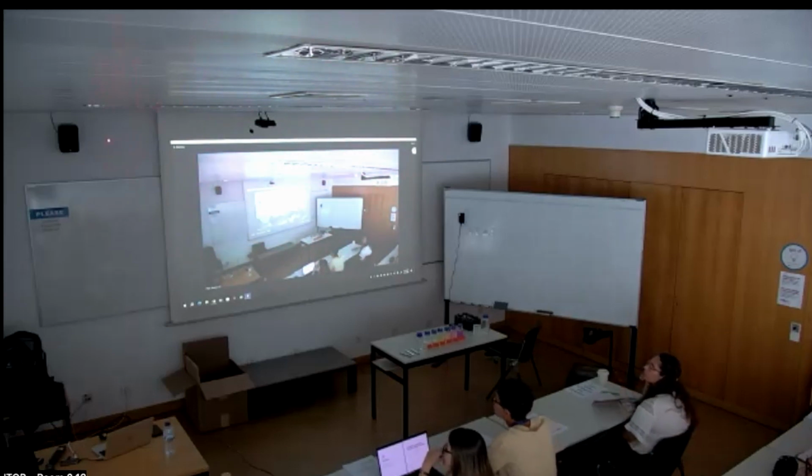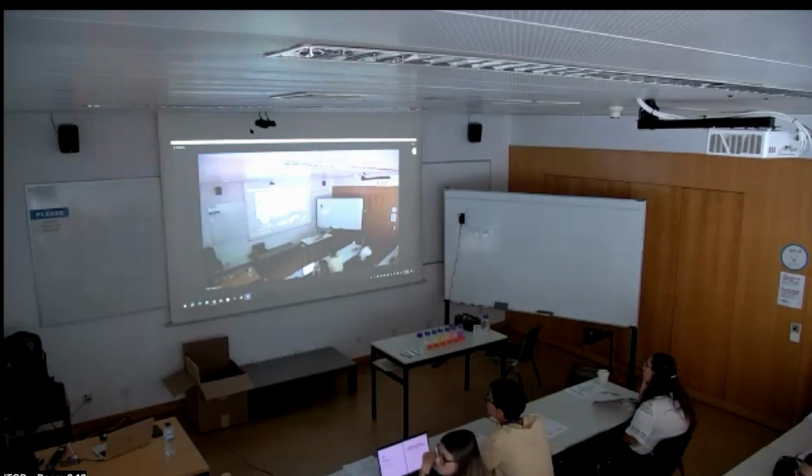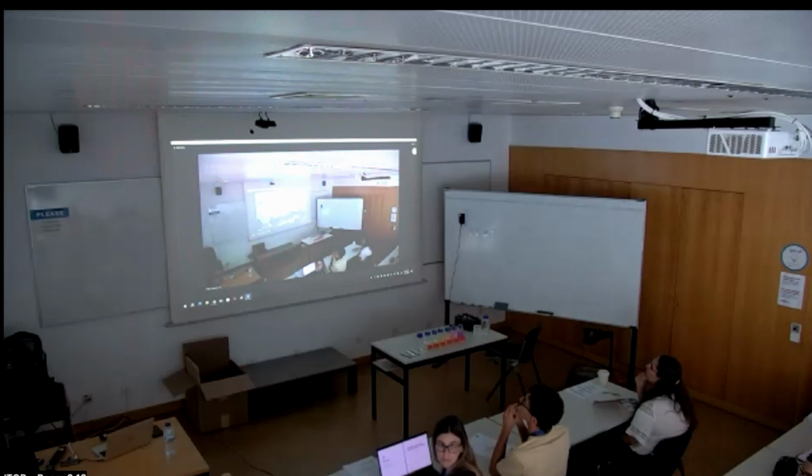So, do you see it? I'm creating a spot of light. Now I will put the wire in front of the source of light. What do you expect as a result? I need an answer, hopefully a wrong one. What would you see? Spread. Somebody else that has a different idea? I need a wrong answer.